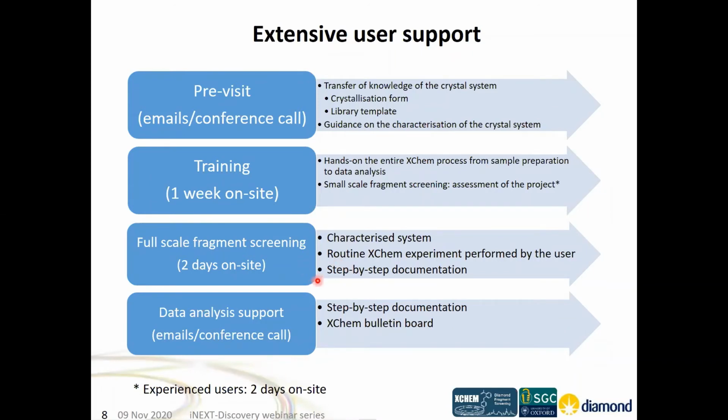In terms of support, we will be on site, but you would have in the lab some step-by-step documentation to help you. Then the data analysis support, this is probably the one that we struggle to cover properly during the training week. That's why we tend to have, again, some step-by-step documentation, and some support by emails or conference call after you've done the full-scale screening.